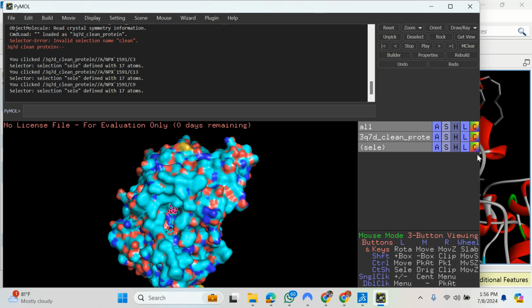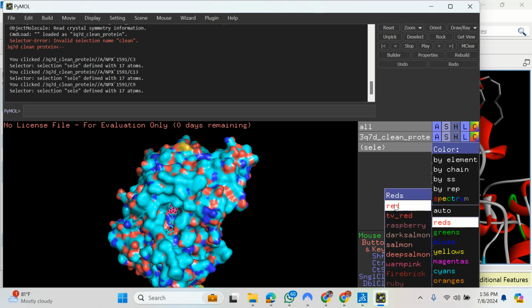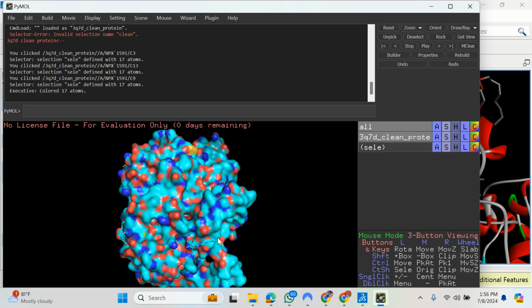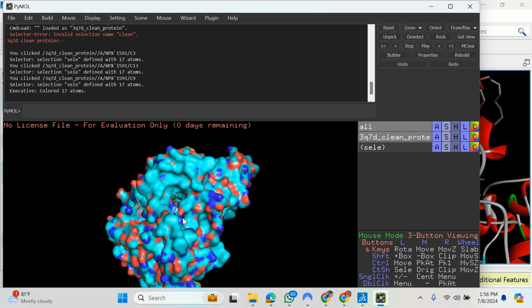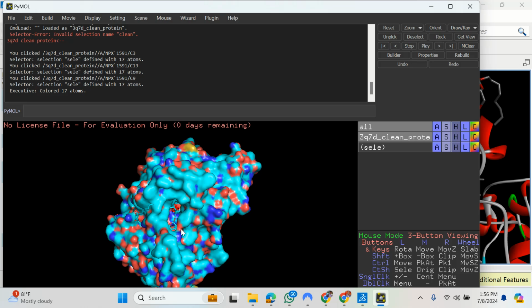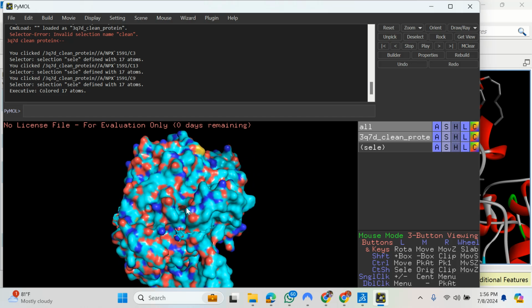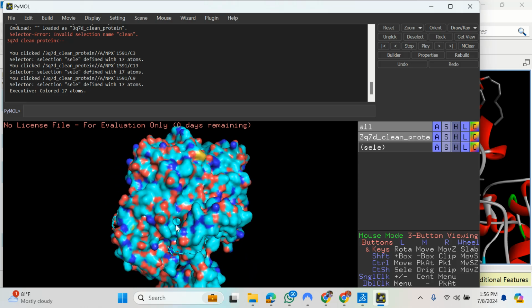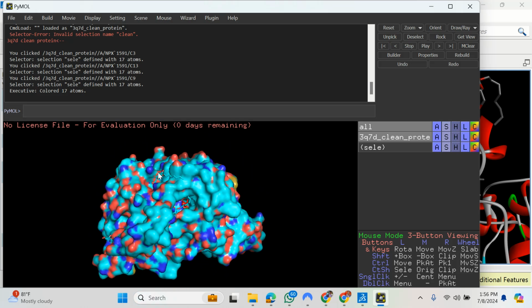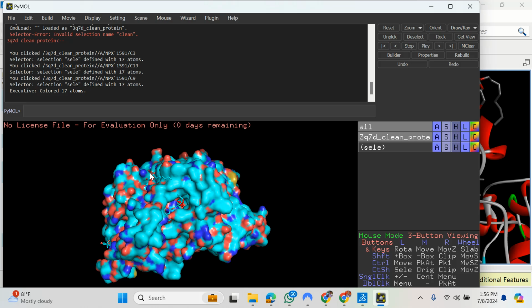That is this group. Let me change it to red. So if I turn like this, you see that red portion. Can you see it? So this is where I know there should be an entrance. So if you target that amino acid, it will enter through here. Then that entrance has a point link with the heme group, because from that pocket the product will move to the peroxidase group where the oxidized prostaglandin will be reduced to normal prostaglandin.